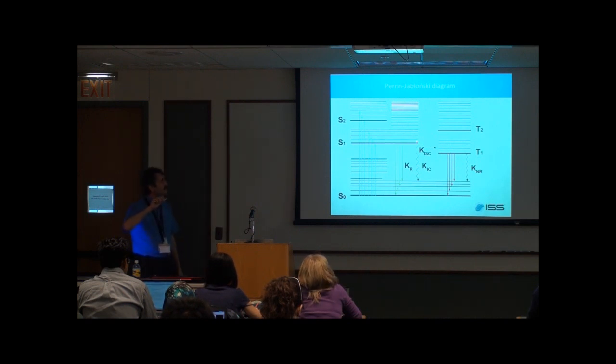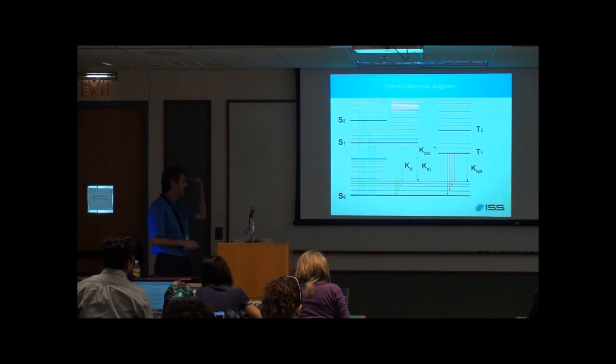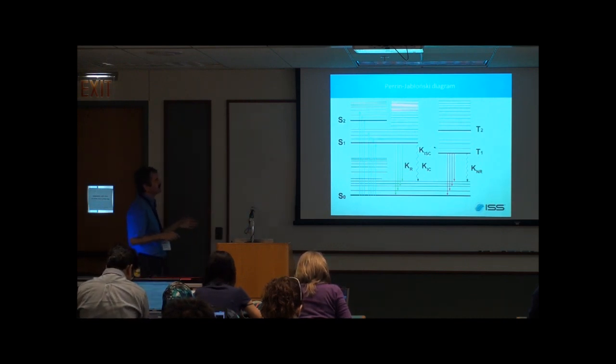There are also other ways of releasing the energy, and these are non-radiative processes. There is an intersystem crossing between singlet states and triplet states. There is also a radiationless decay within the same singlet states. So basically this explains what's happening.